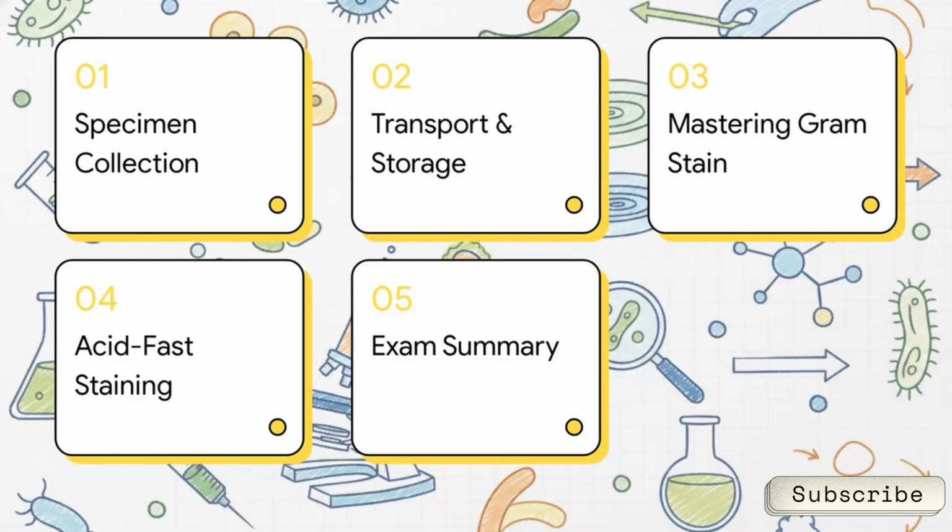Here's our game plan for today. We'll start with specimen collection basics, followed by transport and storage rules. After that, we'll spend some time mastering the gram stain, tackle acid-fast staining, and wrap it all up with an exam summary designed to cement this into your brain.